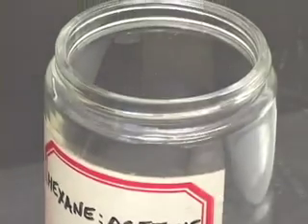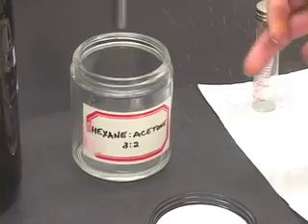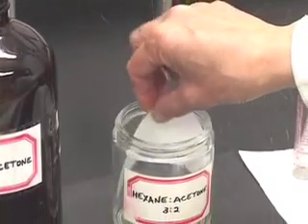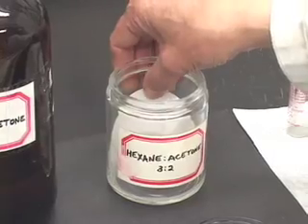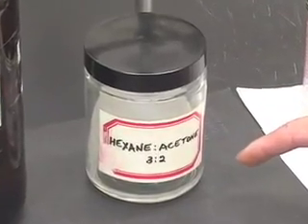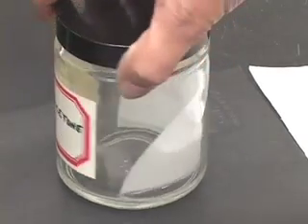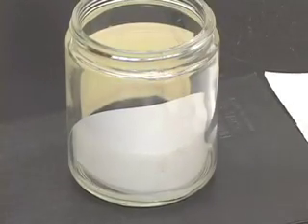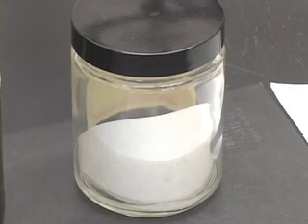Let us cover our reagent bottle. Now we can insert our TLC plate into the developing jar. Before that, what I would like to do is take a piece of filter paper, cut it in half in this fashion, and insert the filter paper into the jar. What this does is act as a wick and saturate the entire chamber with the solvent vapours. That is the reason for using the filter paper.